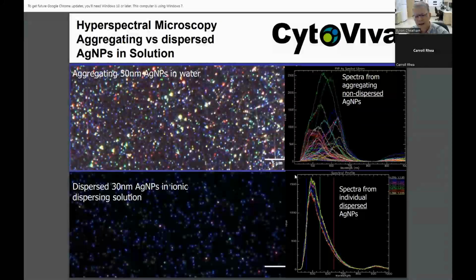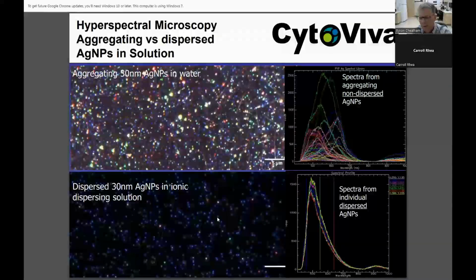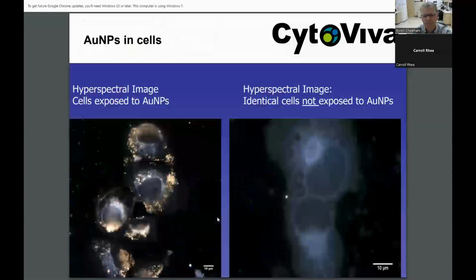And so we're validating with data what our eyes are telling us from a quantitative perspective. And this is an example of looking at how nanoparticles in a different environment will react to the different environment, and measuring that in a quantitative manner.